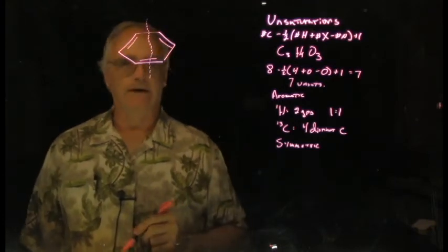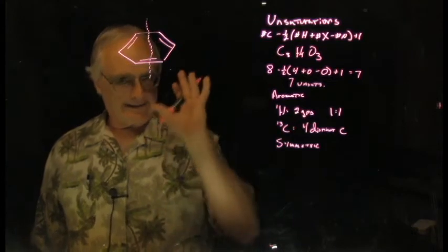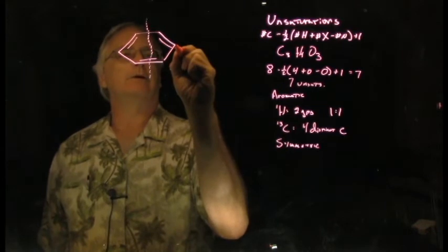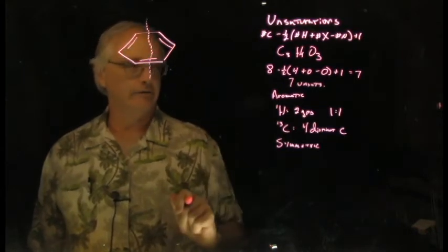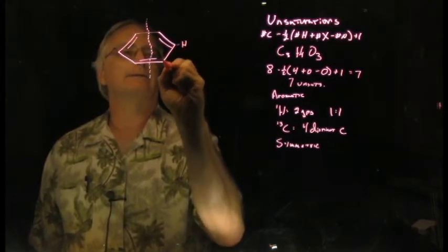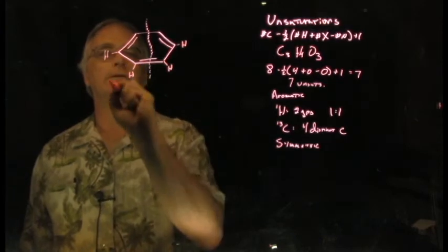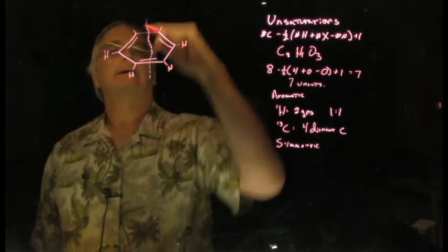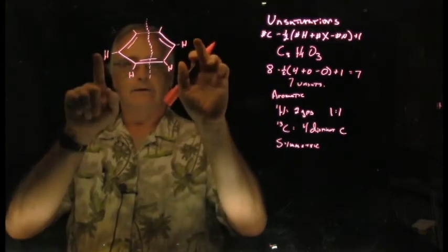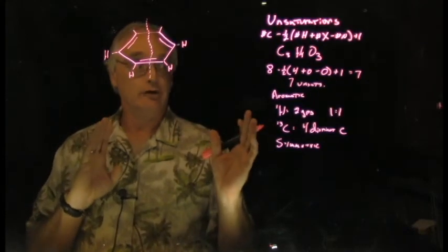And I'm going to indicate clearly one of its planes of symmetry right here. Now, I can make a very strong case that this molecule, with only 4 hydrogens in it, and they're all aromatic, is a ring that looks something like this. Here are the 4 hydrogens, but the hydrogens are on opposite sides of the mirror plane. There's one group integrating to 1, but it's really 2.